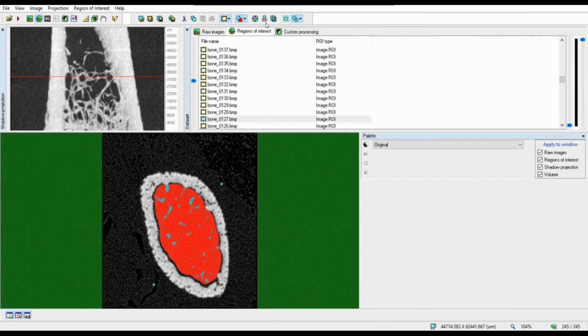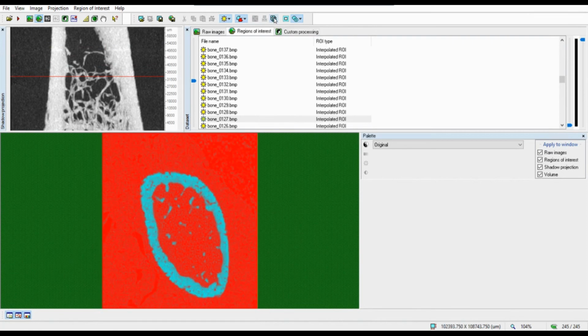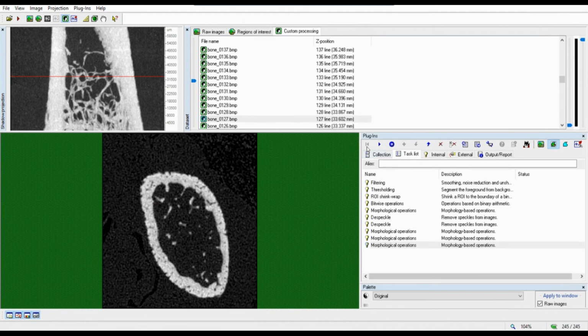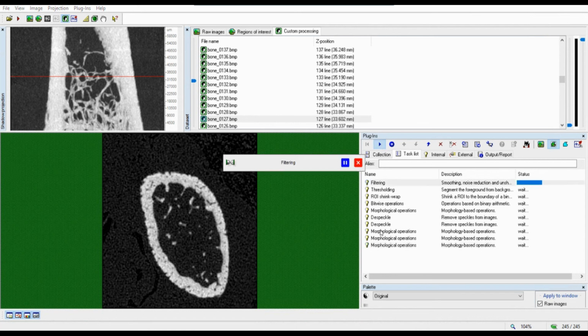So let's go back to our selection. Let me reset here. As I have done some changes here, I have to start over. As I have the task list, I just run the task list until the last one I did. I didn't include the reload, neither the saving.